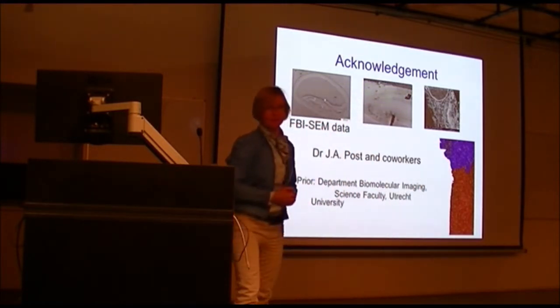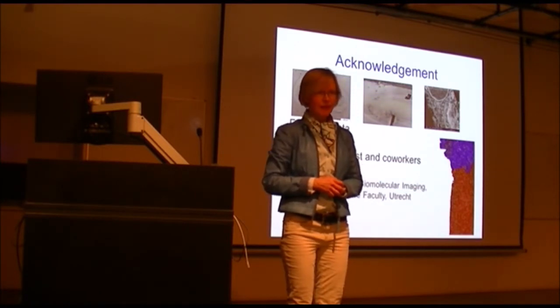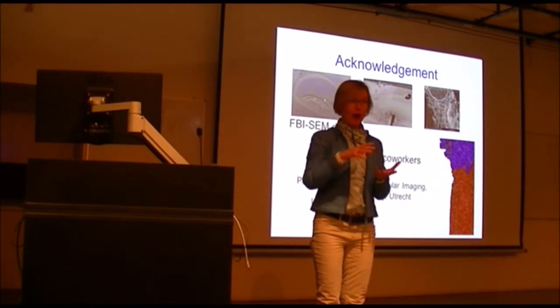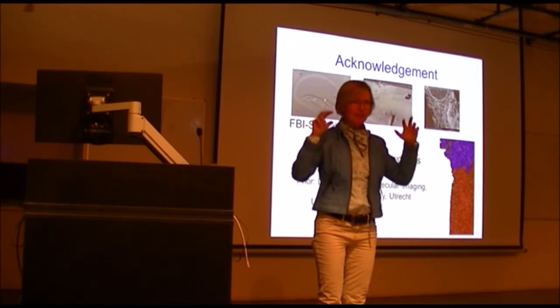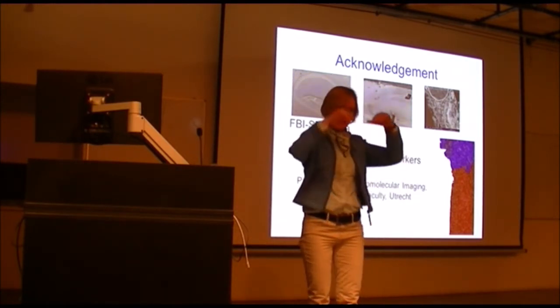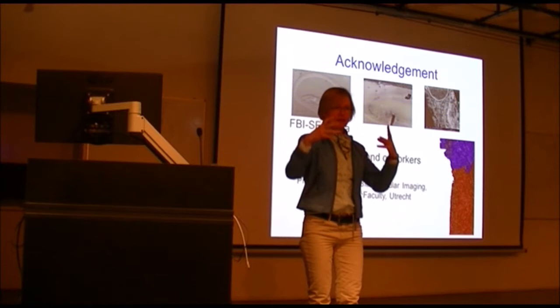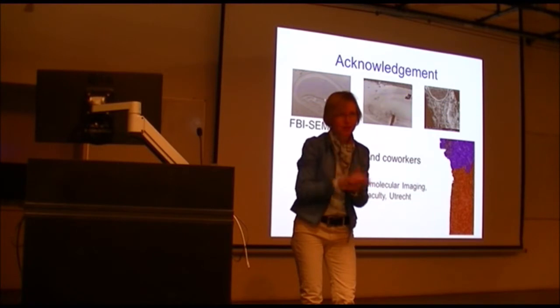I was wondering, so you send a beam of electrons into the tissue, and how do you actually get an image? Do you have a detector, or do you just get an image? Yes. You get an image because you are not looking at real tissue, but either at a cast of it, or at tissue that's stained, impregnated with heavy metals, and all the water in the tissue is replaced by plastic. Then the electrons bounce on these heavy metals and scatter, and you can form an image from that. You see it? Yeah.